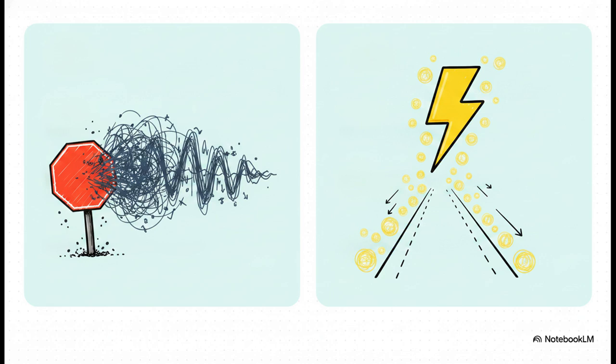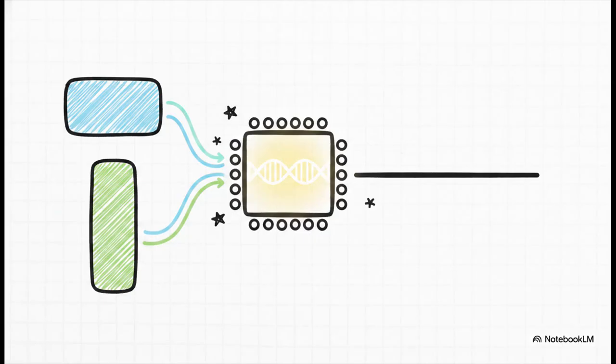Since electricity is conducted in a solution by ions, fundamentally, if we have a higher conductance, it just means we have more ions present in the solution to carry that electrical current. It's a direct relationship. But here's the catch. To make this measurement actually useful across different machines and different labs all over the world, we use something called specific conductance, or lowercase k.